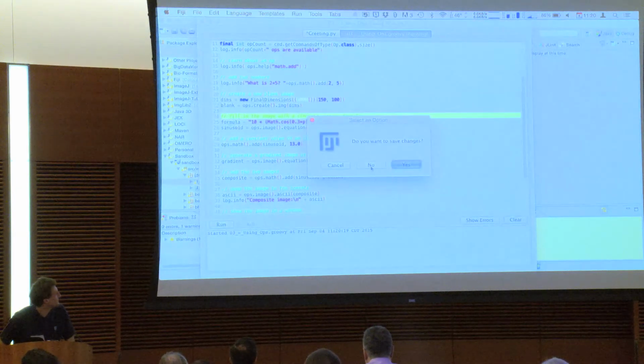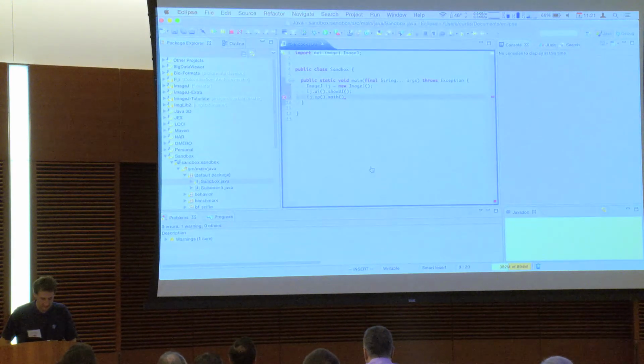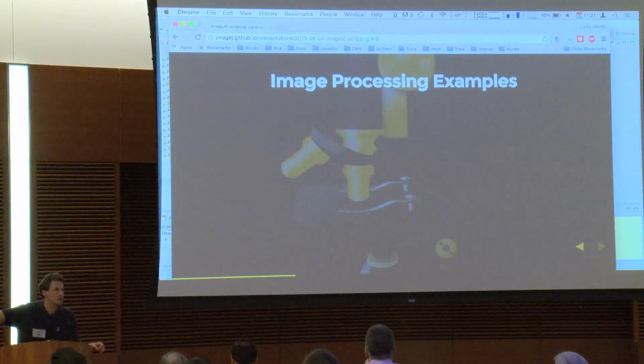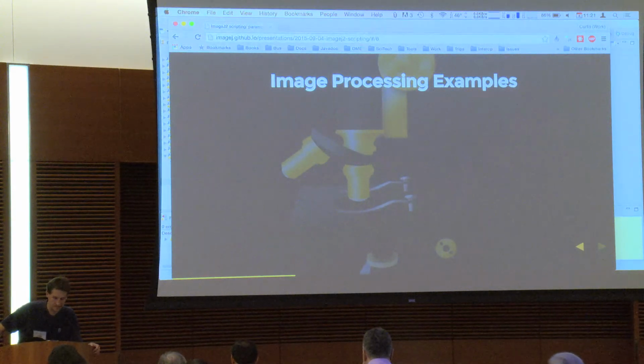All right, with that, I'm going to hand it over to Brian quickly. I just want to make one comment that we're now going to go through some image processing examples, to get to the good stuff of the types of things that are already in ops now, what you can do. There's not going to be much talk about what we're adding in the future, but right now, we're trying to add everything. The goal is that anything you can think of that's a domain agnostic image processing thing, I want it in ops. So contributions welcome. We'll be adding the things that we can as time allows.